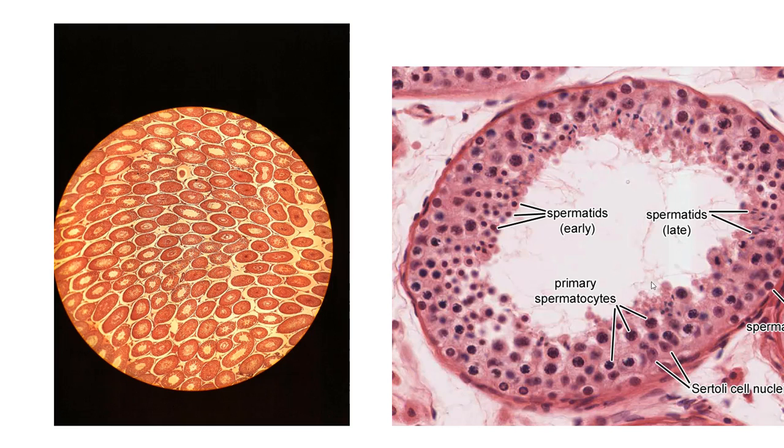And even though it's not labeled, the Leydig cells would be like this. So remember, the Leydig cells are between the seminiferous tubules.